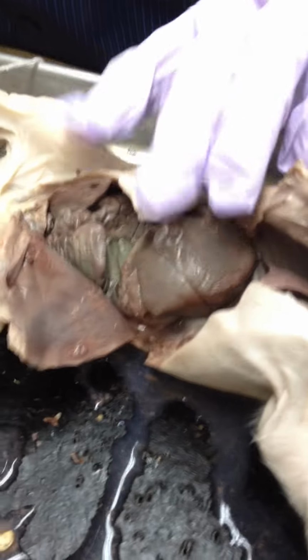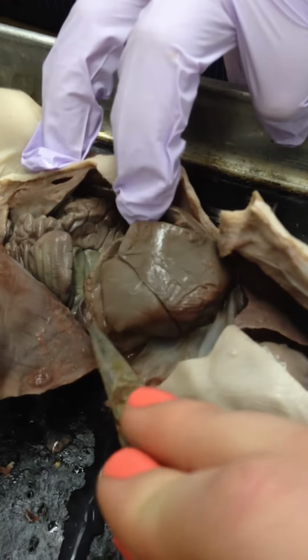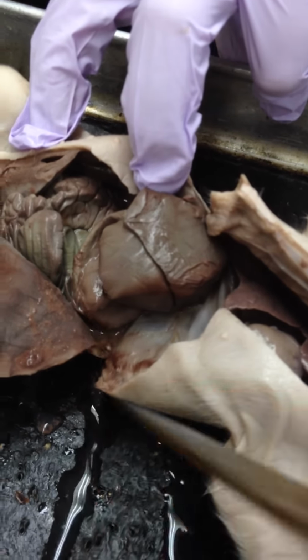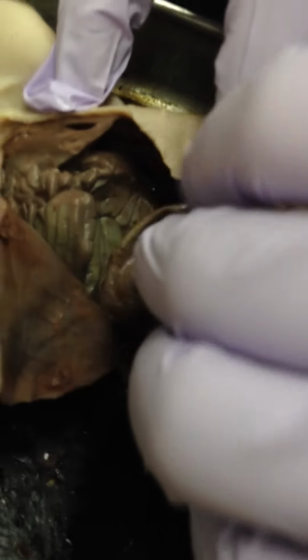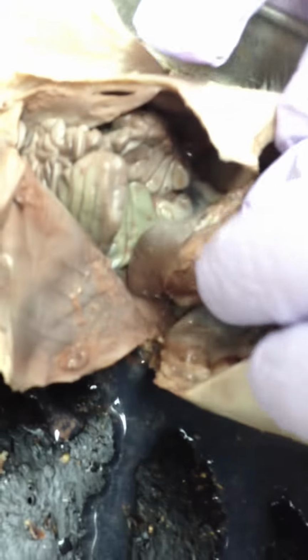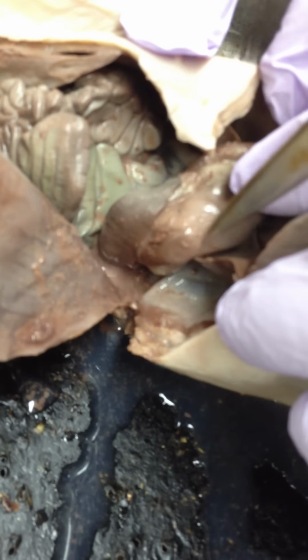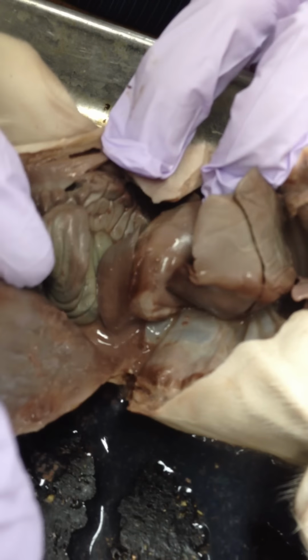So giant one, liver here, and then the spleen there. I thought that was the stomach. No, the stomach is the big guy. The stomach is the big guy, but the spleen is this little flap next to it. So spleen, stomach. Yep. Spleen or pancreas? Spleen, I think.